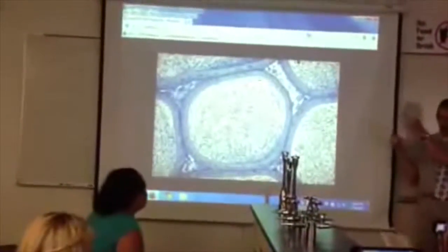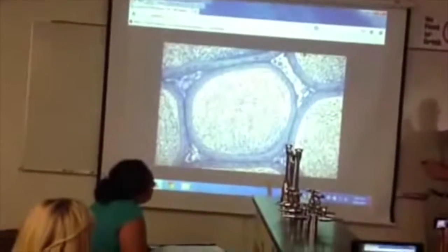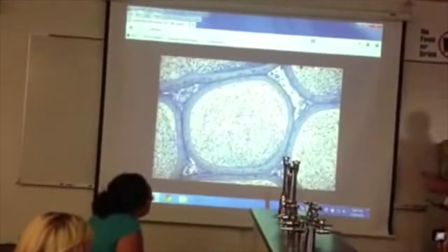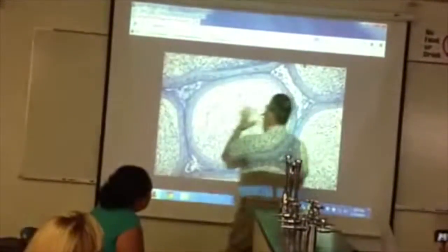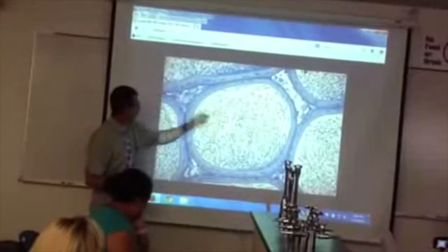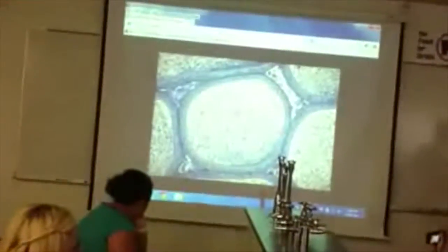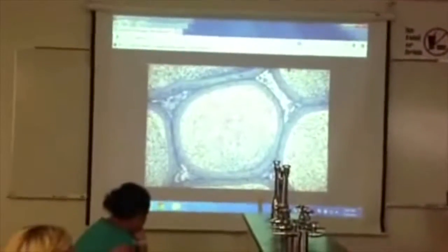So it's got tubes, right? There's only two options for tubes. Testis or epididymis? Which one? Epididymis, because there are tubes with only one layer in the ring, lots of sperm, and lots of white space. So that's not a testis. Testis have multiple layers, really tight. So it's epididymis.